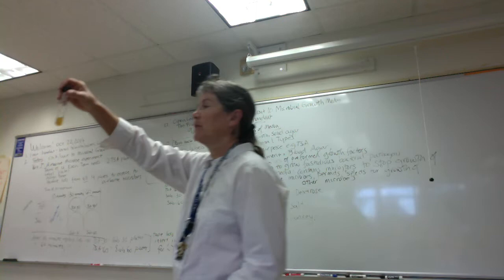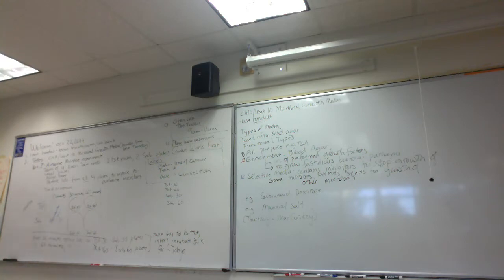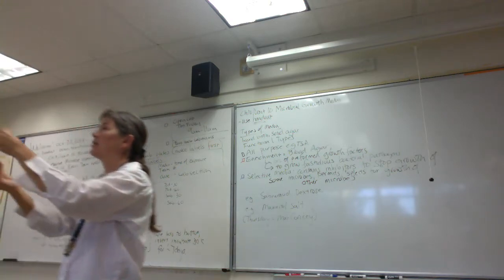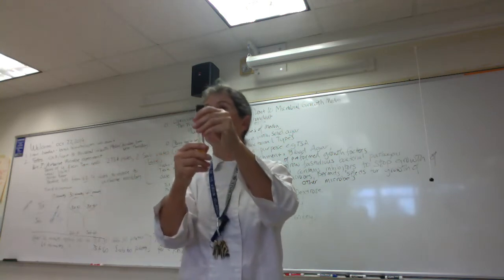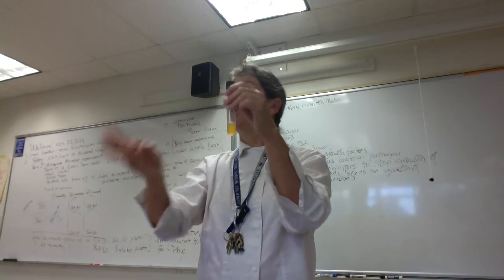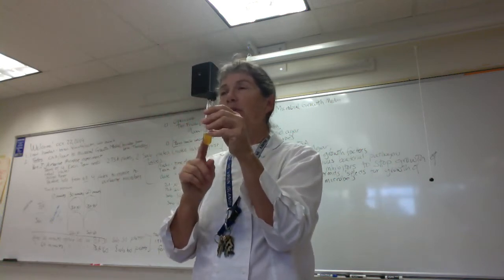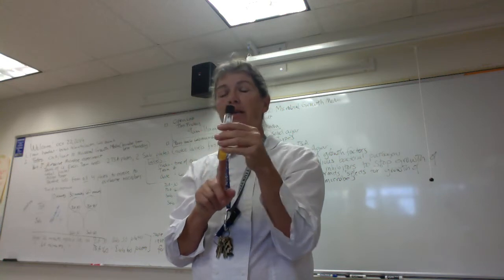So folks, if you're growing cultures in broths and you put them in an incubator, when you pull them out, just gently mix them. Sometimes the cells will settle to the bottom, and you might think, oh, they didn't grow, because the broth appears transparent. But again, just gently tap them so that it will resuspend the cells. Okay. So again, folks, we know cells are present. We don't know if they're alive or dead.